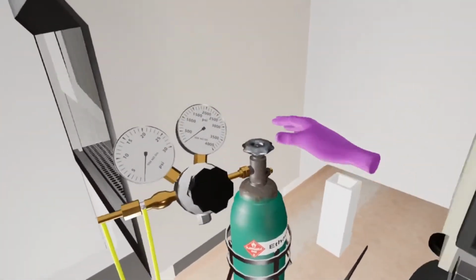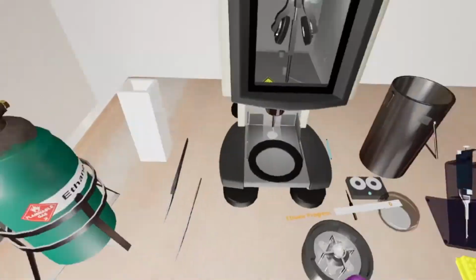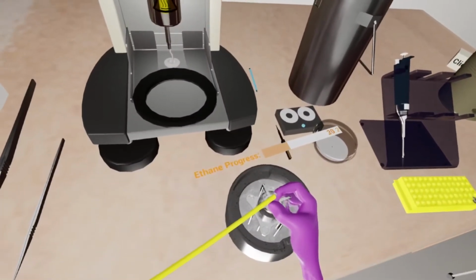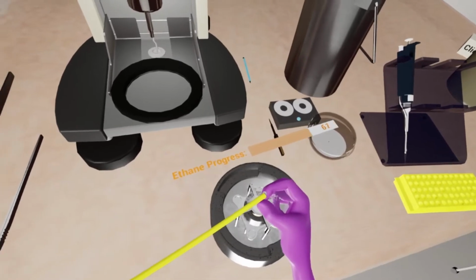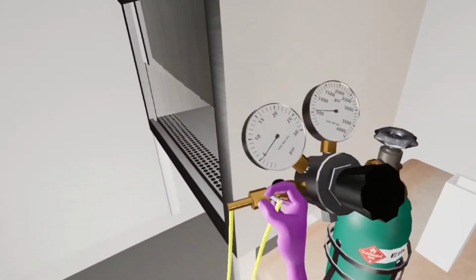Now the workstation is cooled down. Now pick up and place the ethane dispensing tip into the center cup of workstation. Keep filling until the ethane cup is 100% full. Then, put the ethane dispensing tip back.